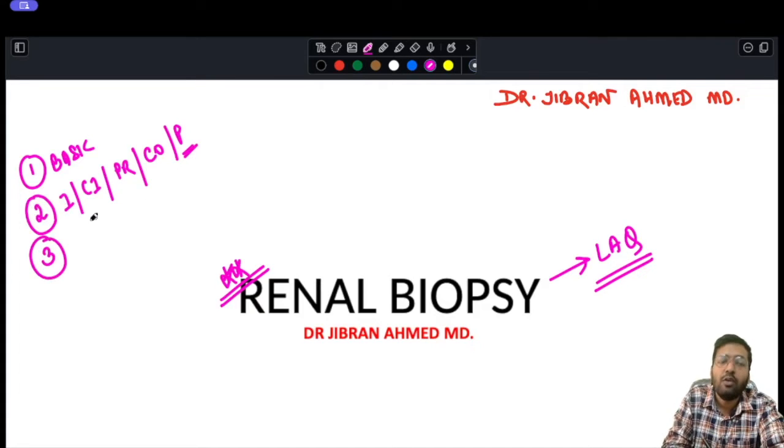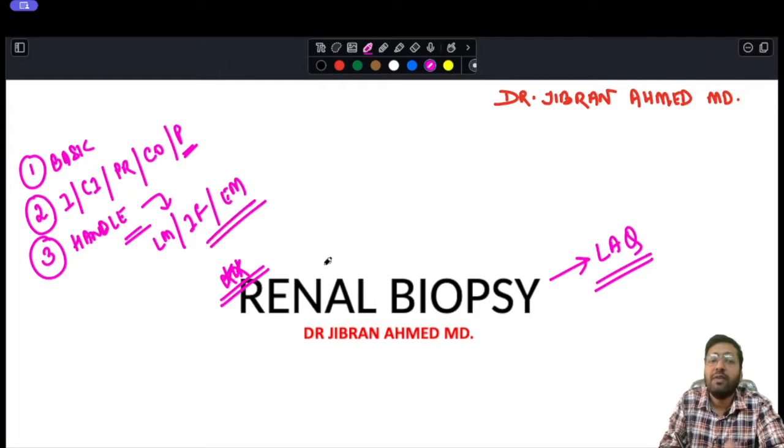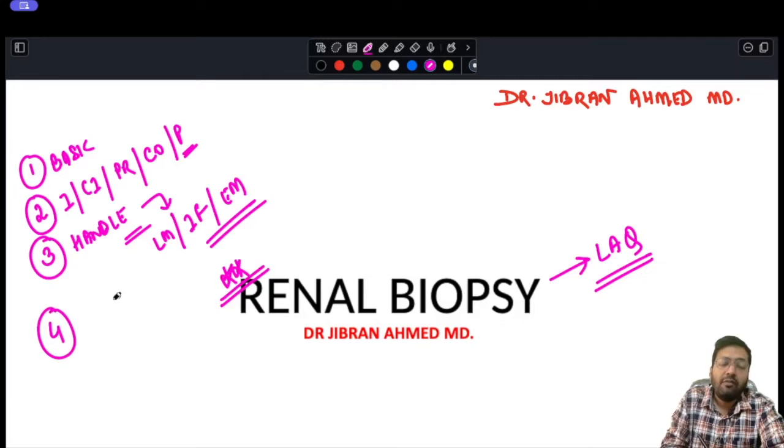Apart from that, we are also going to discuss how you handle the biopsy after you have procured it, how you divide the biopsy for light microscopy, immunofluorescence or electron microscopy. What are the different fixatives used, and what are the special stains that we use while evaluating a renal biopsy. After that, we are also going to discuss in detail the individual components.